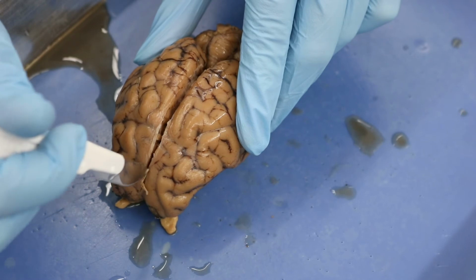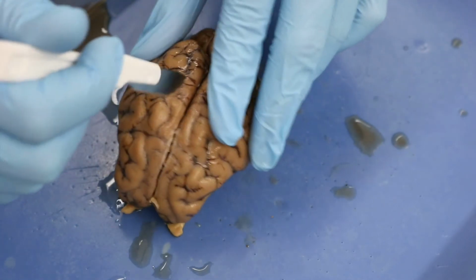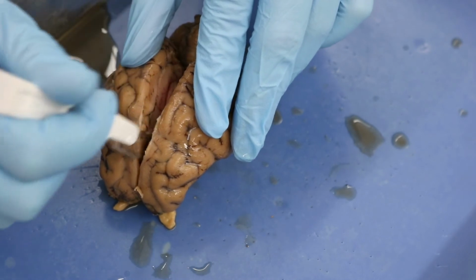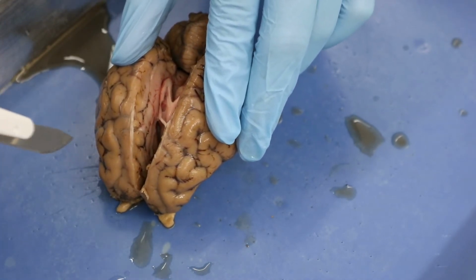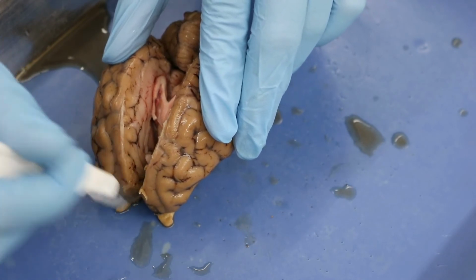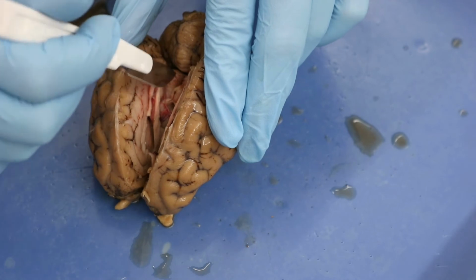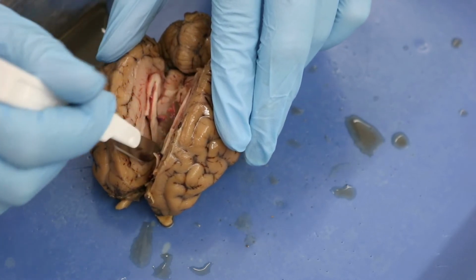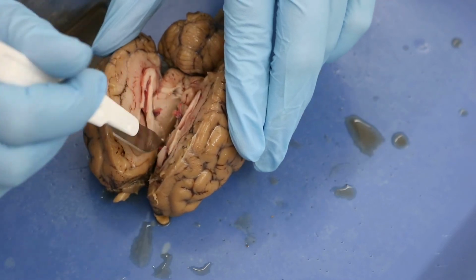Small, smooth cuts, okay? And then we're just going to keep cutting deeper and deeper with our small, smooth cuts, and you can see that I'm putting traction on it as I'm doing that so that it slowly opens up. Small cuts all the way across.